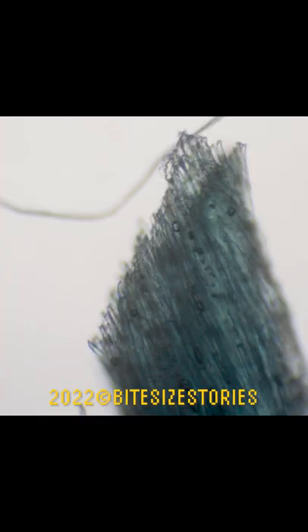One strand of dental floss can easily carry 25 pounds of weight. What else would you like to see under the microscope? Let me know in the comment section.